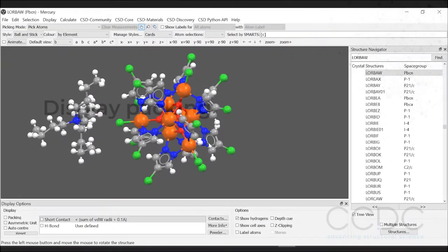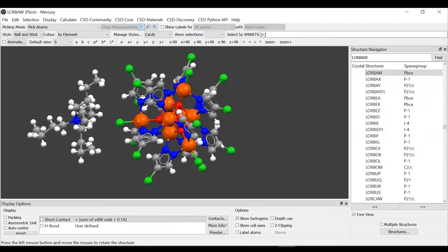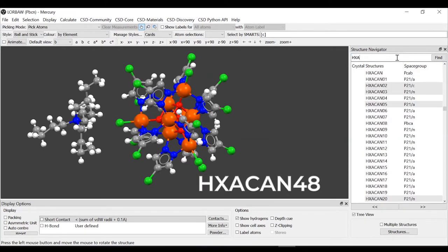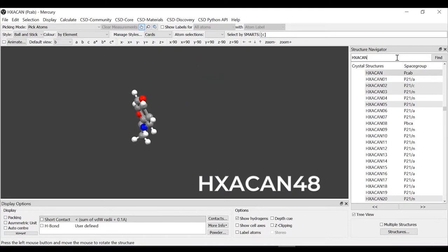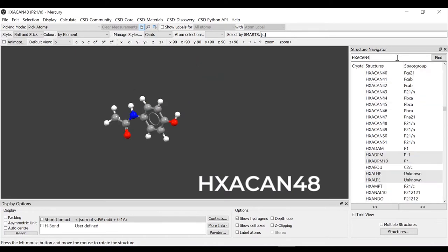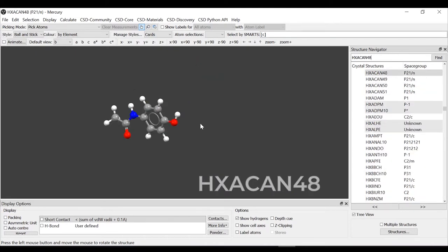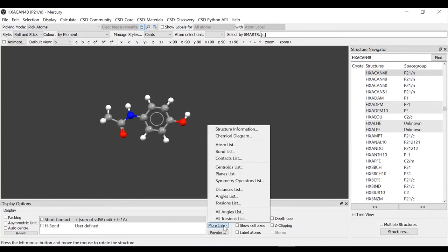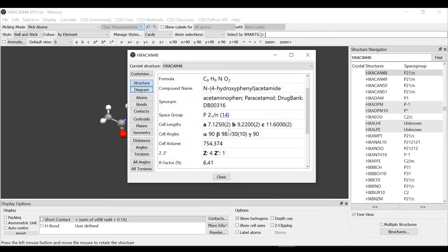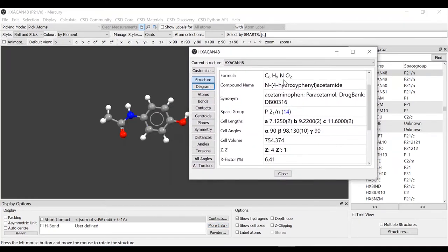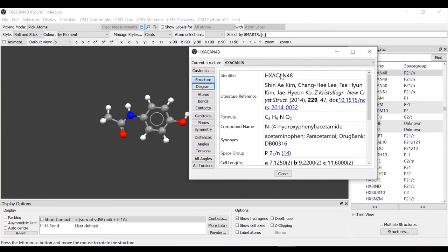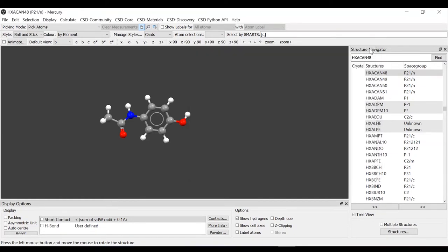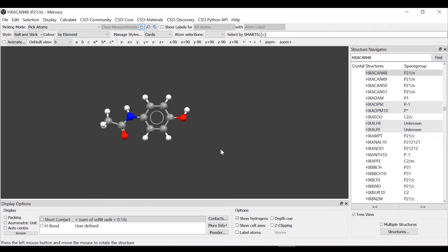We will change structure to study the packing. The next structure is HXACAN48. This molecule probably looks familiar. If we want to learn more again, more info, structure information. Here we have the compound name but also the synonym, which you probably already guessed. This molecule is paracetamol. And again, our diagram.